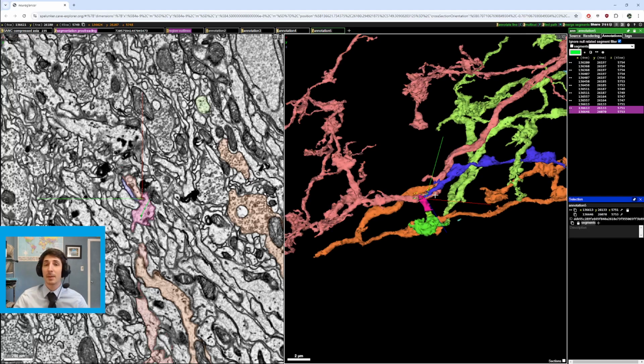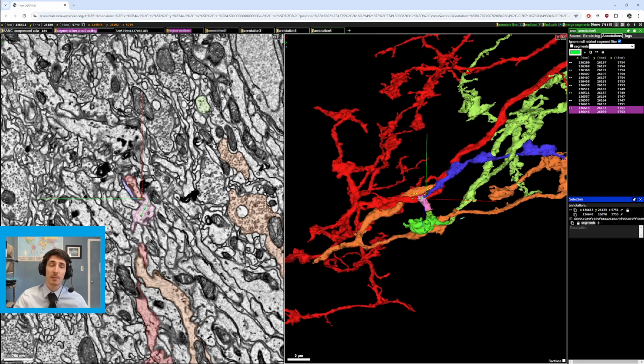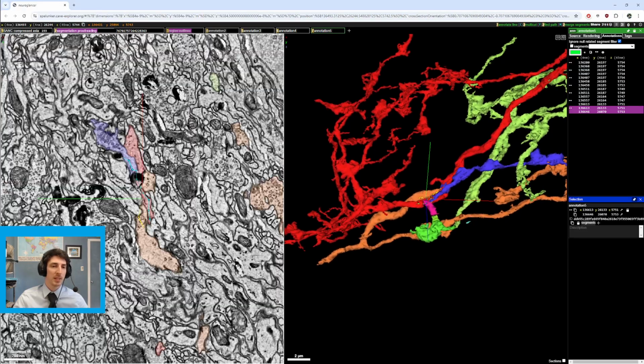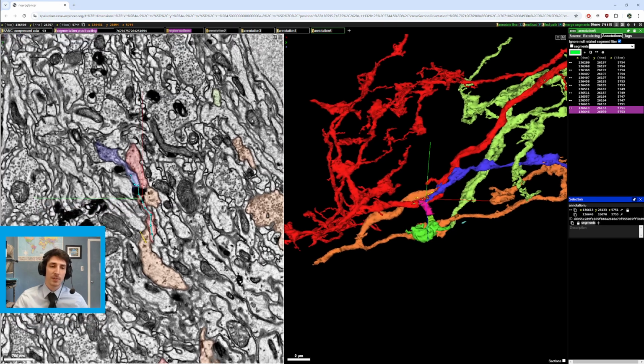What's going on, guys? Welcome back to another Spelunker Neuroglancer guide video, where today we're going to be talking about using colored annotation point pairs. So we did a point pair paths guide earlier. This one will be similar to that, so if you've already seen that, this might just be extra information. Where this guide differs from that guide is we are using colored point pairs in this.